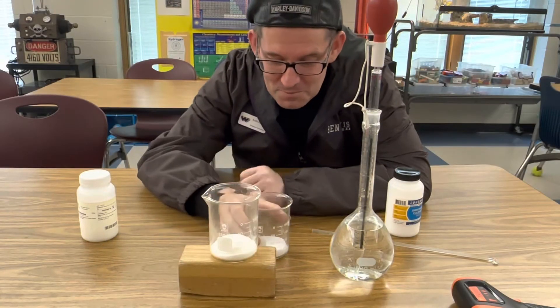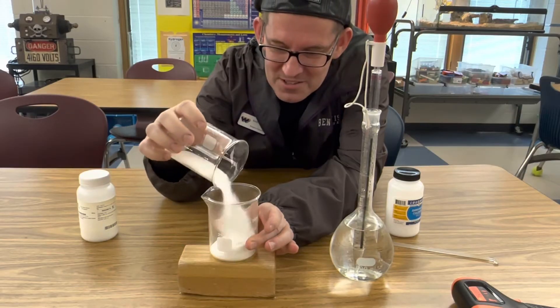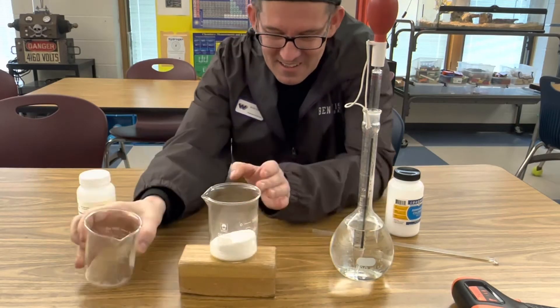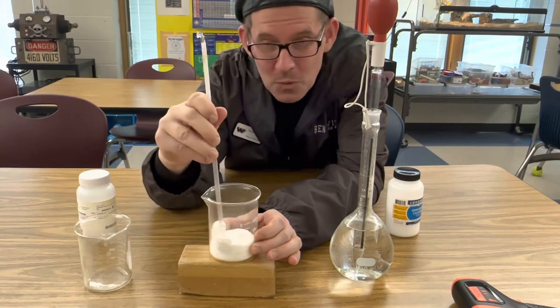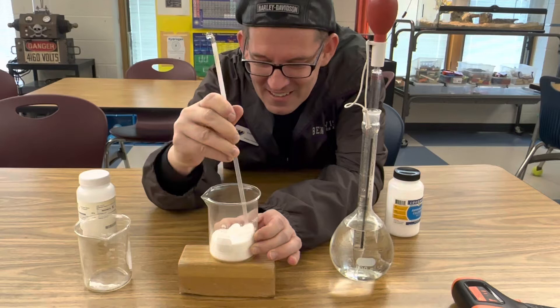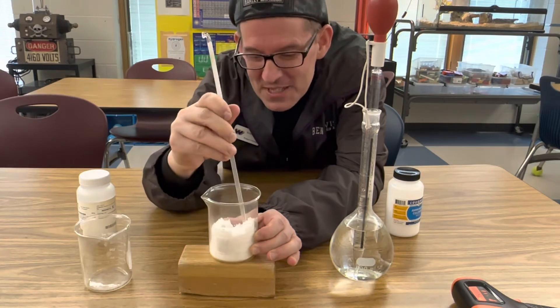Okay, now I'm going to pour the other beaker in and we're going to start stirring it. As we stir it, it's going to absorb the heat from the water underneath the block until eventually the block of wood will freeze to the beaker.